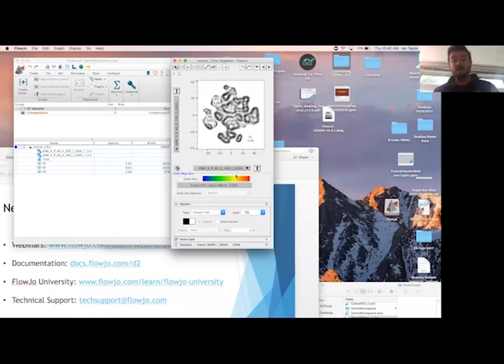So speaking of other parameters, we've identified a few different populations. Now let's look at how the different parameters look heat mapped, or color mapped, onto this plot. In order to do that, I'm going to check this box for color axis, and it's automatically going to color by this first parameter, CD56. And what we see is the range of CD56 isn't widely varying. Maybe there is something under P1, I'm not sure, no. So mostly green events, I'm not even seeing red events, which means we don't have a lot of high CD56 events in this data set after gating on CD3, which we should keep in mind.